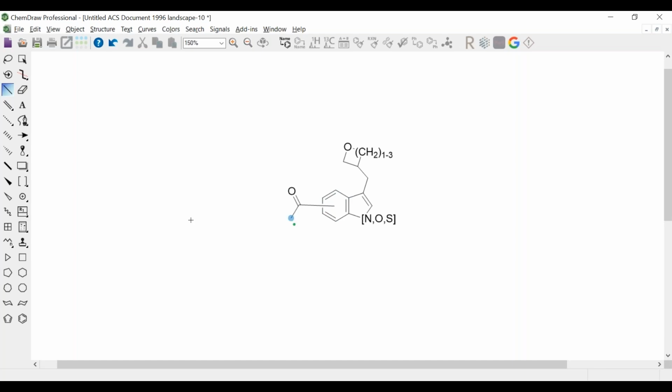And then the last thing here for the R group, there's actually an icon over here for the query tools, and it's where you can define the stereochemical kind of relationships to specific atoms if you want to do that. The R1 table is, again, something that if you have ChemDraw Prime, you're not going to have access to it.